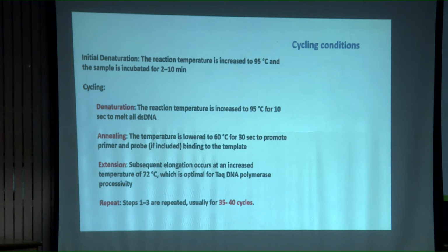Two reasons. One is resources are getting depleted with every passing cycle. There would be a resource crunch. dNTPs may not be available to sustain the reaction forever, number one. SYBR Green is getting depleted with every passing cycle, the quantum is getting halved, correct? And the enzyme loses its activity after performing its polymerization, right?